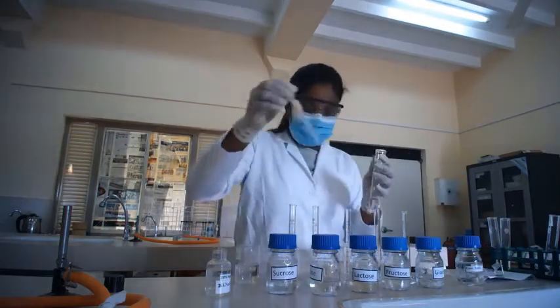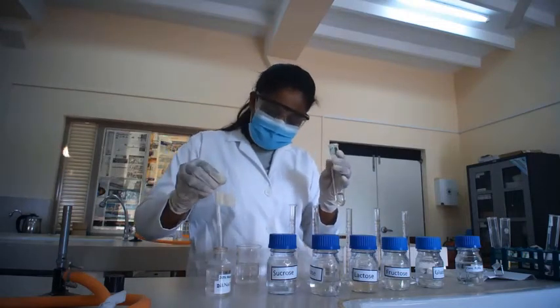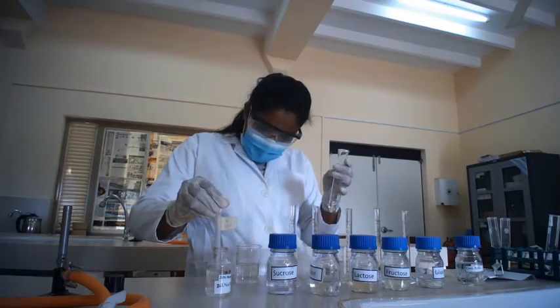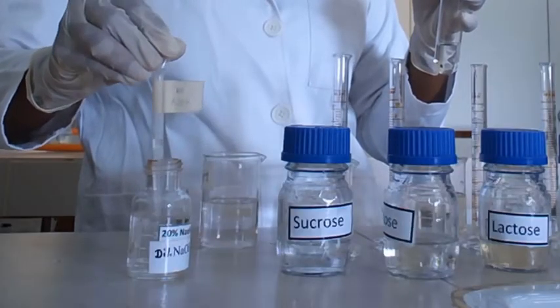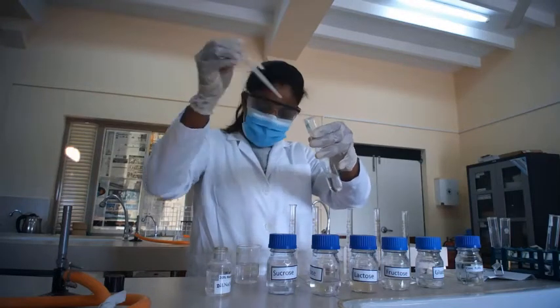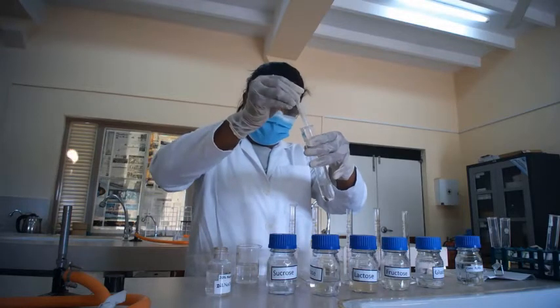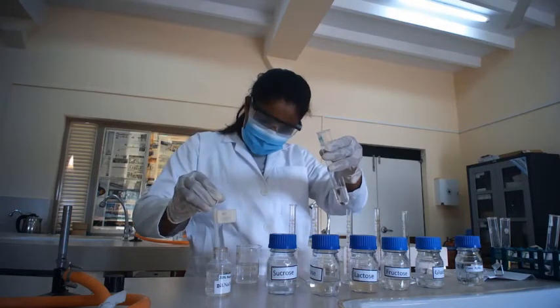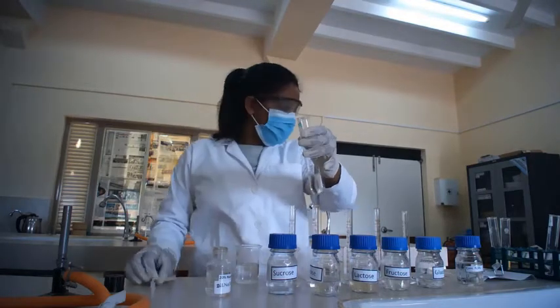Next you are going to add 5 milliliters of 20% sodium hydroxide into the maltose solution. And boil.